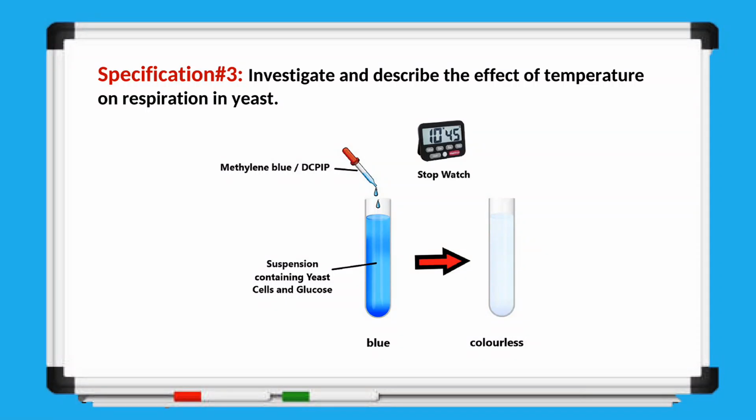Next, we also have the investigation section in this chapter. According to specification number 3, we need to investigate and describe the effect of temperature on respiration in yeast. So, let's take a look at this practical activity in detail.